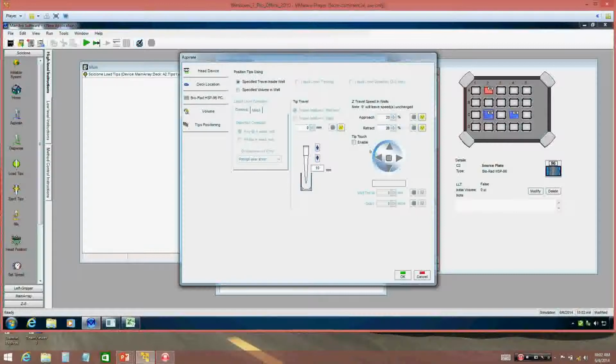Now, as you're going left and right and across the deck, you may want to go at 100%. Library prep or even capture steps are several hour processes, so you want to go at 100% across the deck if you can. However, when you're doing your fine liquid handling, you don't want it to go in your liquid at 100% and come out at 100%.